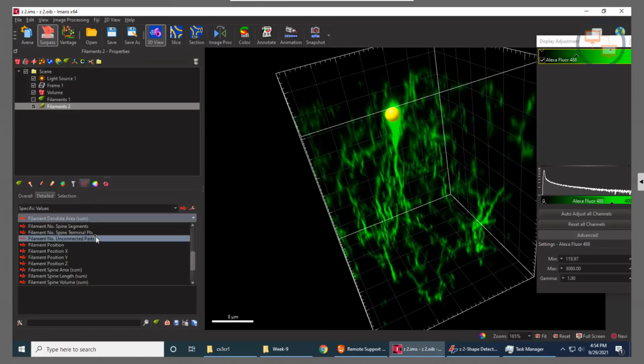Yeah, definitely. Thanks for bringing that up. Because any kind of remote work, which is what I'm doing right now, I'm remotely accessing Workstation 0 from the Whitehead building. That is going to degrade the apparent resolution or apparent quality of the image. But all of your statistics, all of your analysis is still going to be done on that machine where you're running the software.